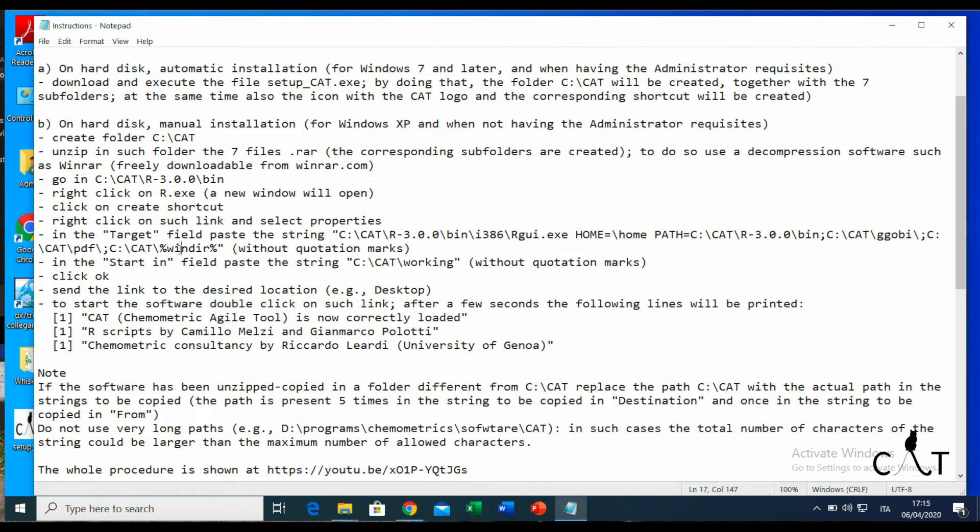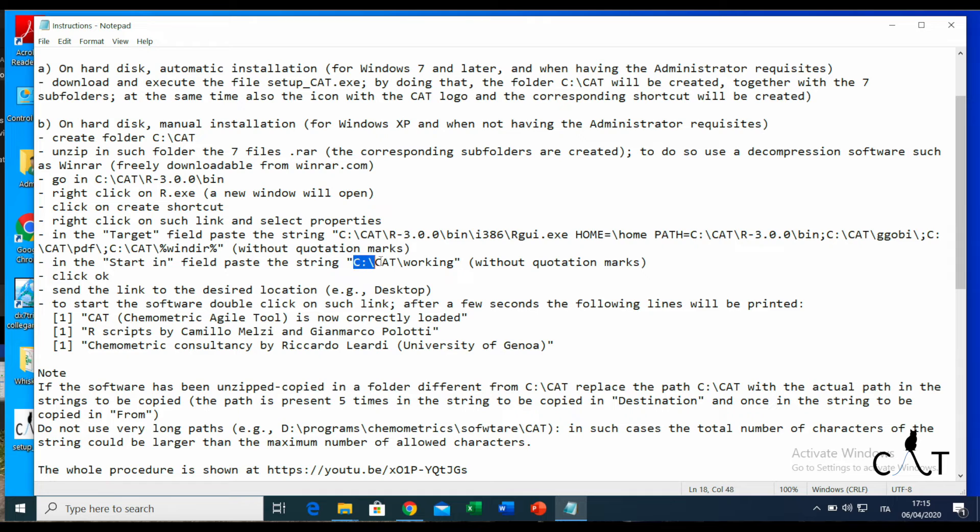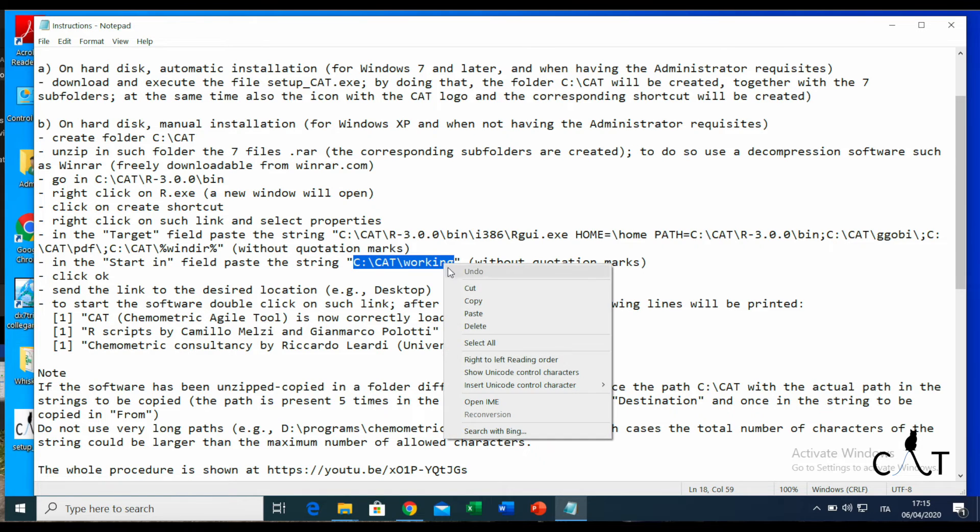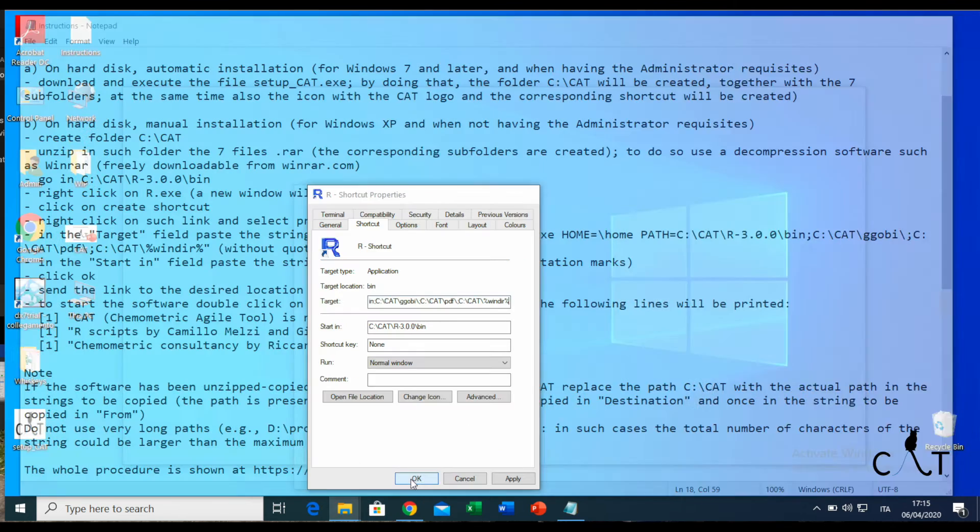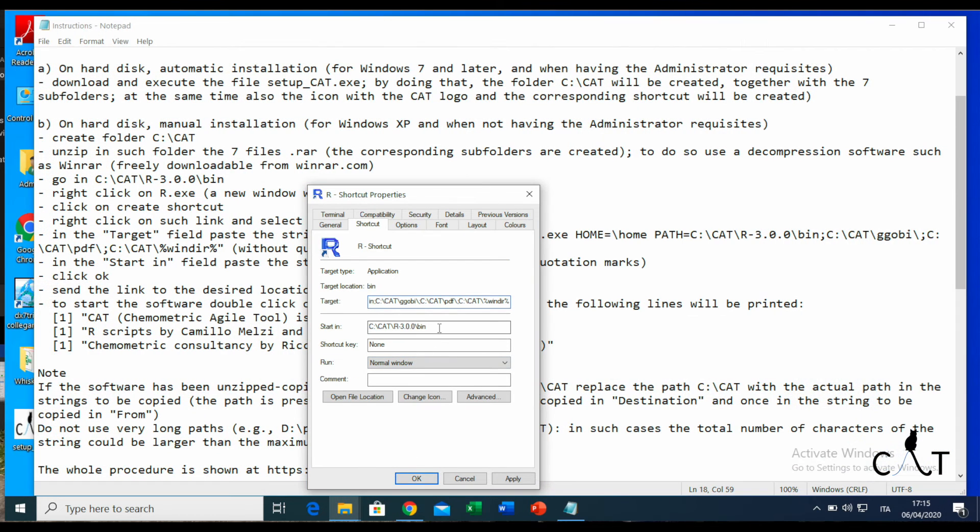Here it goes. Now we need to do the same for the field start in, and we copy again without the quotation marks.